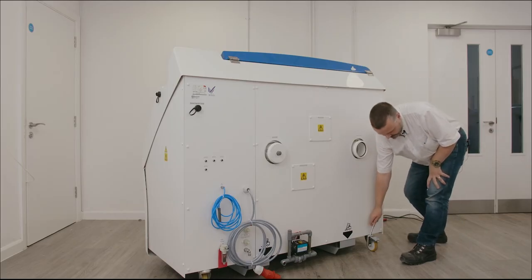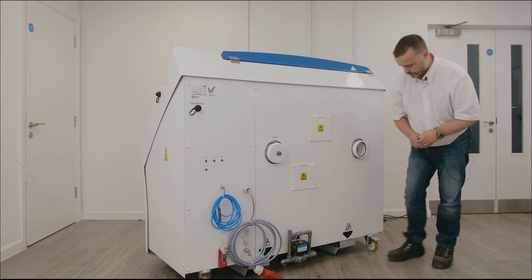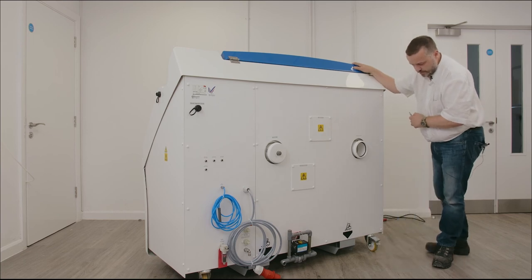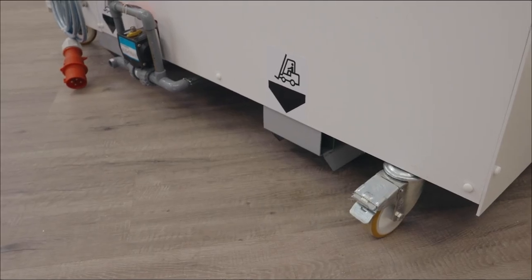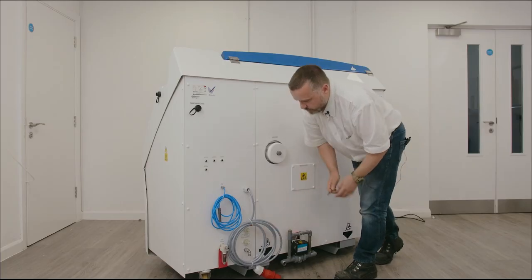At the base of the chamber we have heavy duty casters which can be locked by pressing with your foot onto the locking mechanism and we have two forklift access points which allow the chamber to be moved and lifted easily.